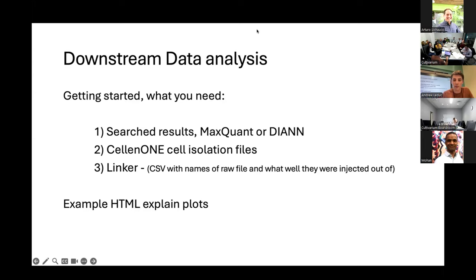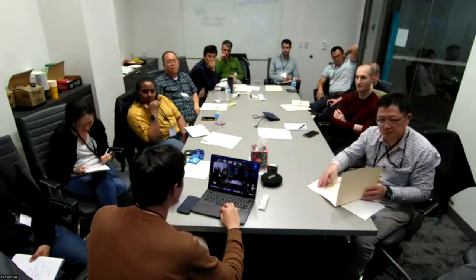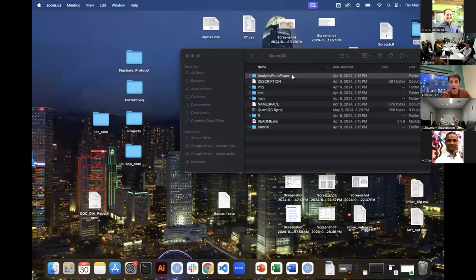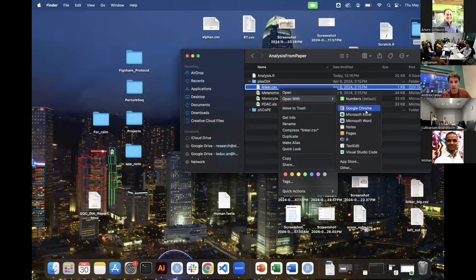Do you have an example sample of the linker? Yeah, let's just open one up. Why not? It's super simple. If you go into the GitHub, let me just do this. Okay, so this is just the GitHub folder. So you see, let's open this up.